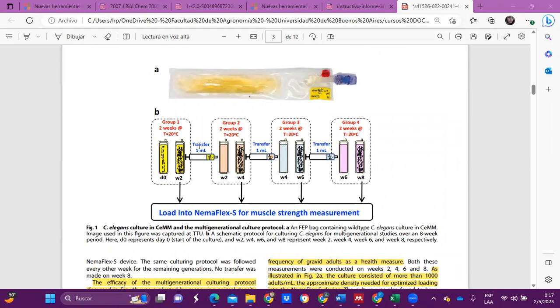Primary bags with approximately 1,000 larvae per milliliter were prepared at day zero and incubated at 20 degrees for two weeks. On week two, one microliter of medium with worms was transferred from this bag to a new bag filled with almost 20 milliliters of fresh medium. The new bag was incubated at 20 degrees, and the old bag was used for loading the worms into the NemaFlex device. The same culturing protocol was followed every other week for the remaining generations. The efficacy of the multi-generational culturing protocol was evaluated by measuring animal density and locomotory health during eight weeks of multi-generational experiments.